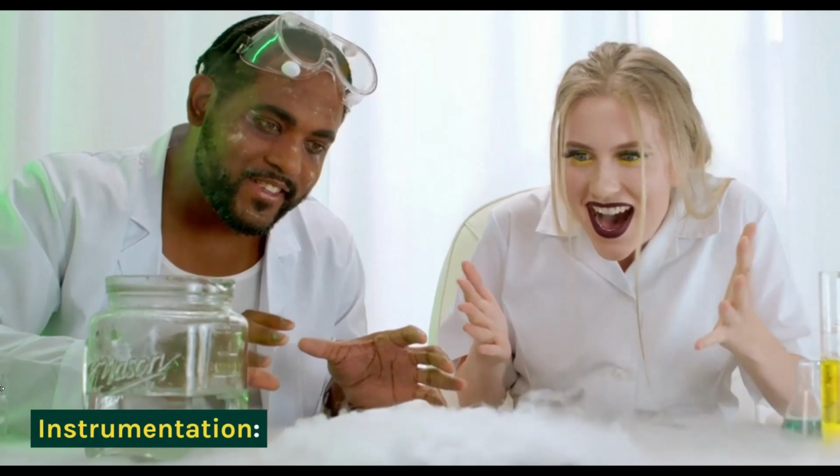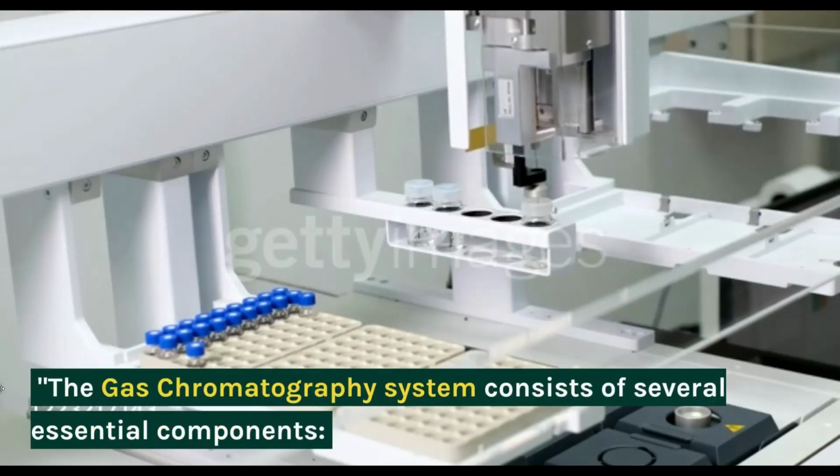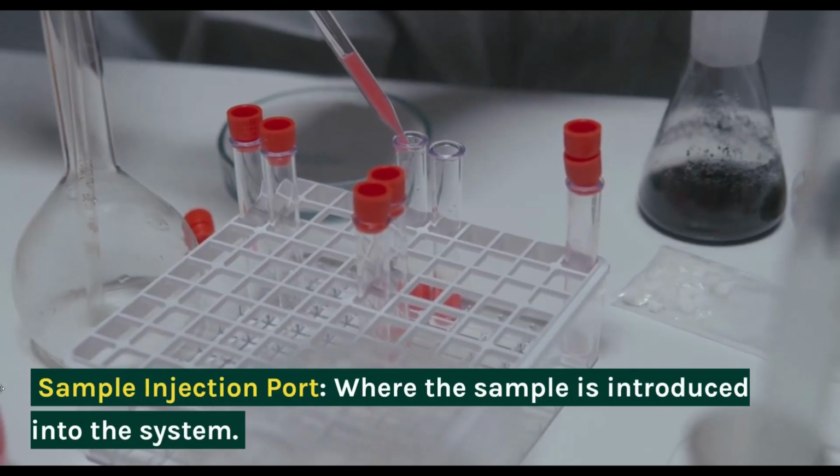Instrumentation. The gas chromatography system consists of several essential components. Sample injection port, where the sample is introduced into the system.